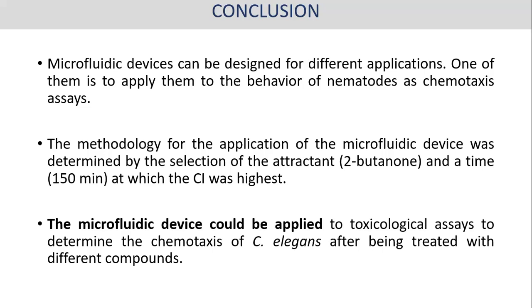The microfluidic device could be applied to toxicological assays to determine the chemotaxis of C. elegans after being treated with different compounds.